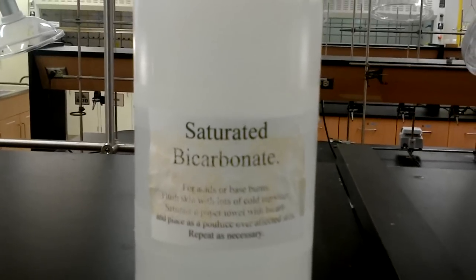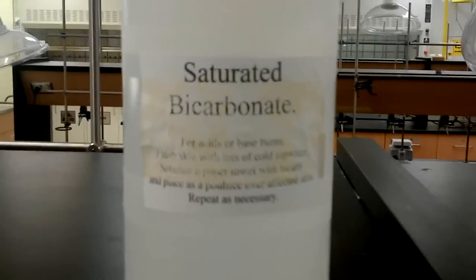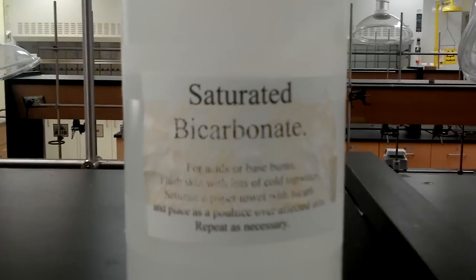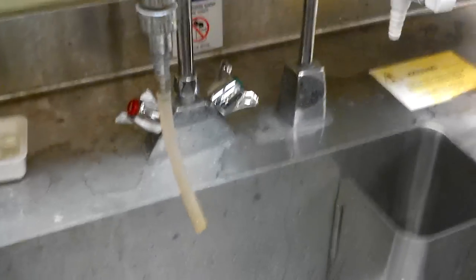Now, in the lab, we always keep saturated bicarb solution. This is for acid and base burns. So if you do get a lot of acid on you, you quickly run over here to the sink, and you wash, wash, wash. Then you run back over here, and you get the sodium bicarbonate, and you splash that on some paper towel.